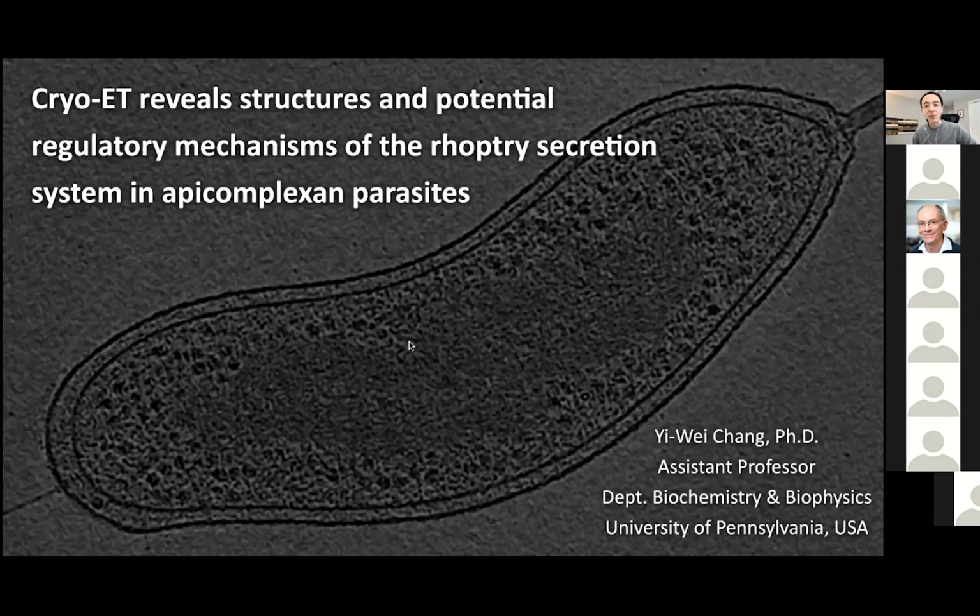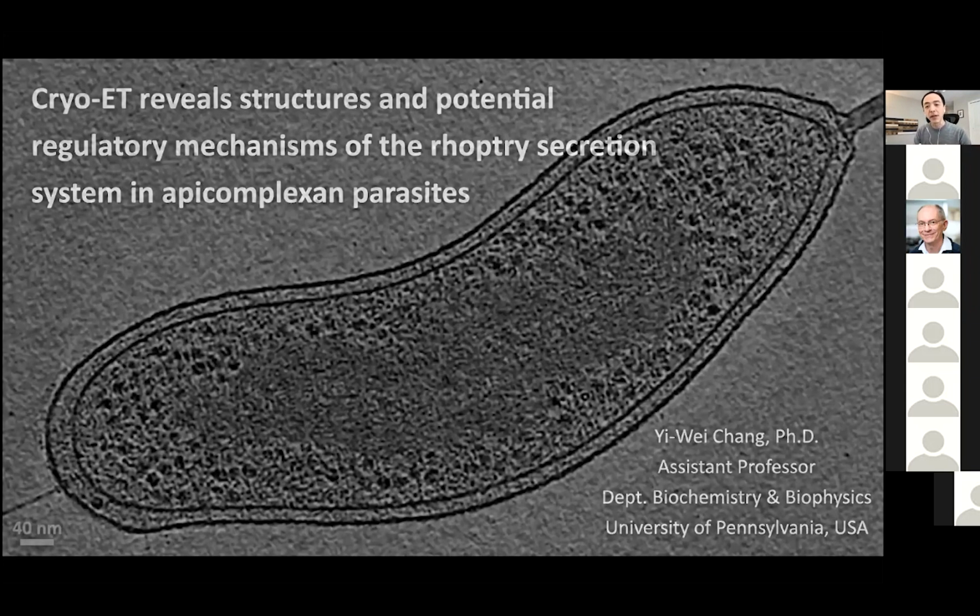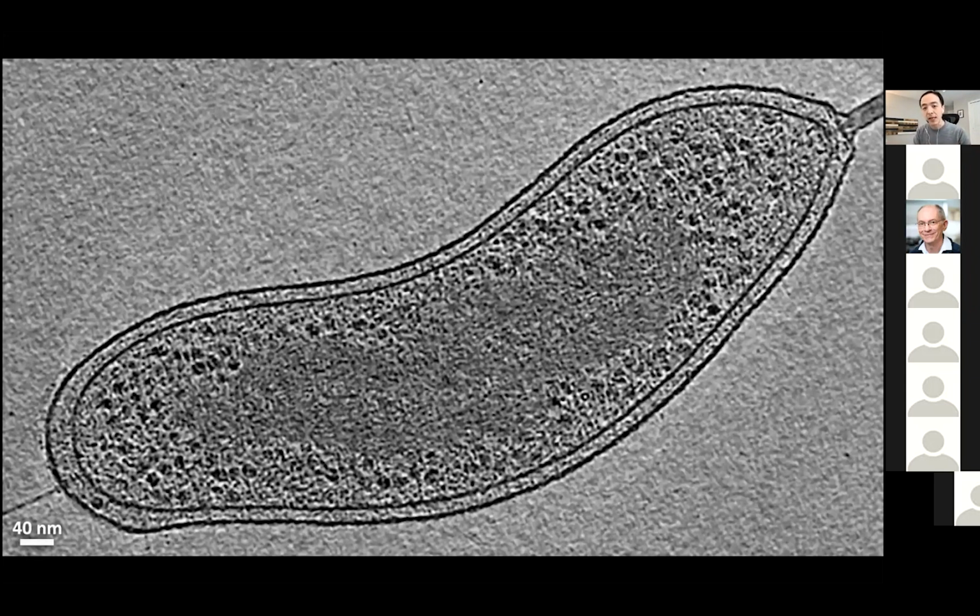My lab specializes in using cryo-electron tomography, Cryo-ET, to look into frozen cells in 3 dimensions so we can understand how big molecular machines structurally conduct their function in situ. For example, if we use Cryo-ET to look into a bacterial cell, the resolution allows us to see individual ribosomes inside the cell. In some cases, we can even see different subunits of those ribosomes. Very importantly, in this type of sample, not only are protein structures well preserved, but the membranes are also well preserved.